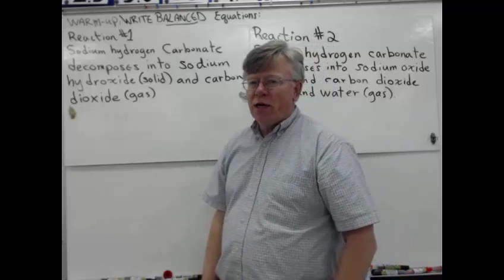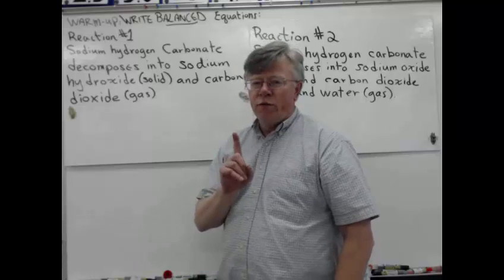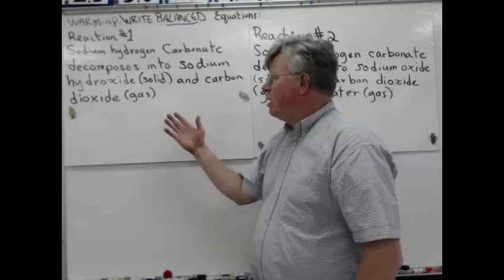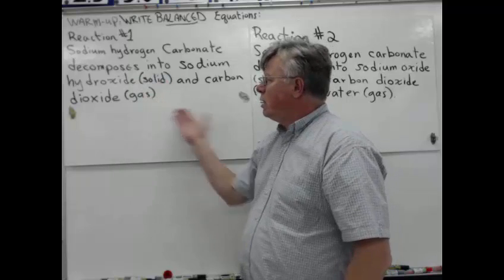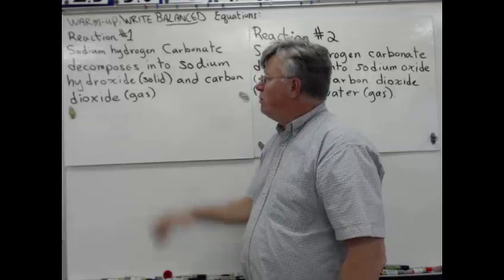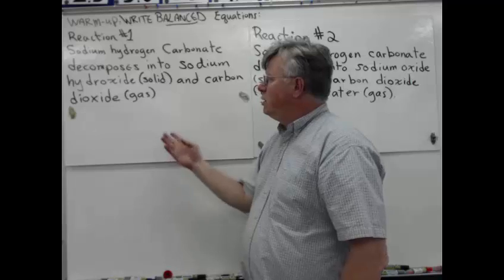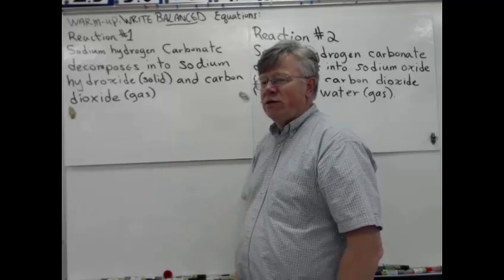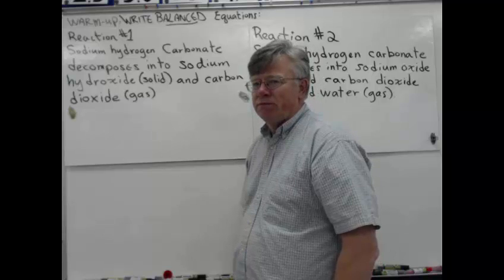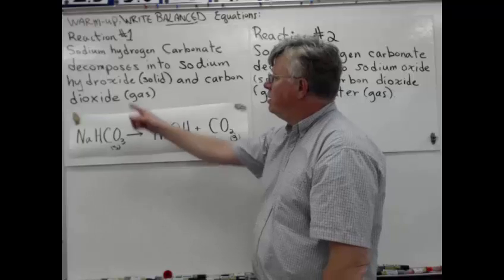The way this lab is set up, I have three possible chemical reactions, only one of which is the true and real chemical reaction. The point is to try to figure out which is the true chemical reaction using stoichiometry. So this is the first chemical reaction, reaction number 1. Maybe you could try this, write it down on your paper, and then in a moment I'll put the answer up here. Okay, this is the answer to the first one.